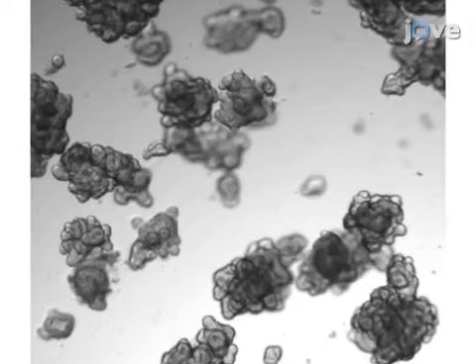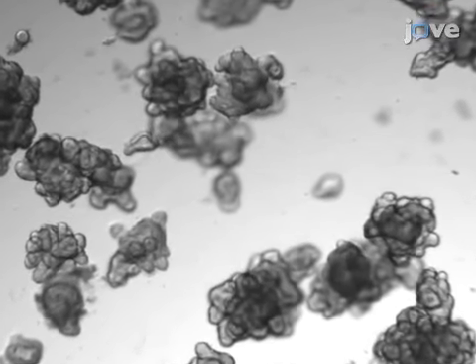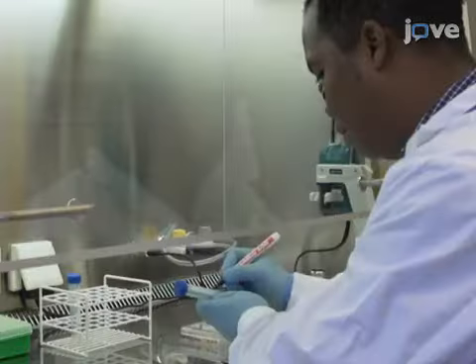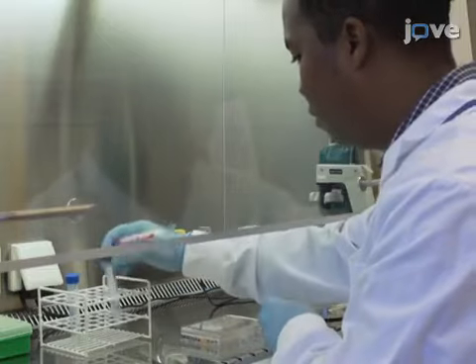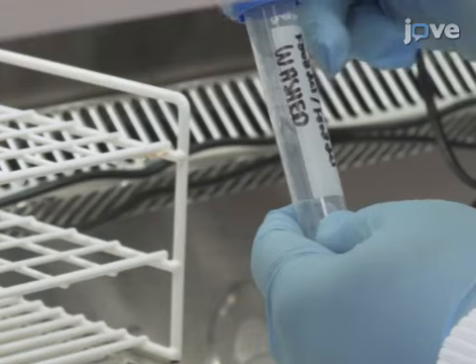For obtaining optimal Forskolin-induced swelling assay data, it is essential to work with a culture containing big organoids with multiple buddings. After identifying such a culture, label one 15 ml conical tube with the sample name and one tube as washed.